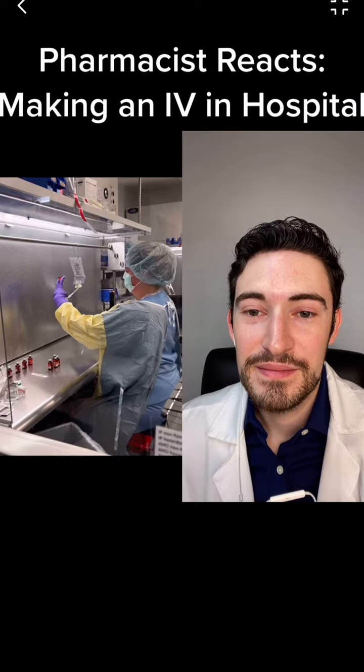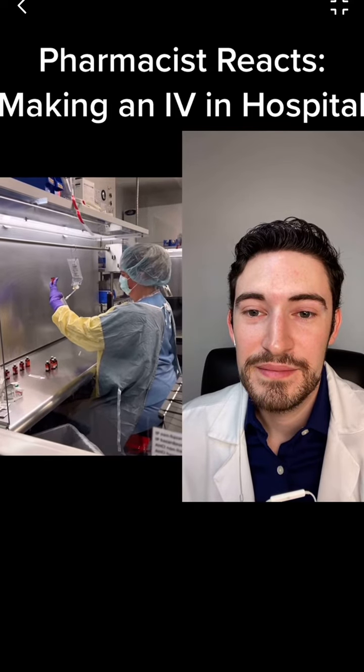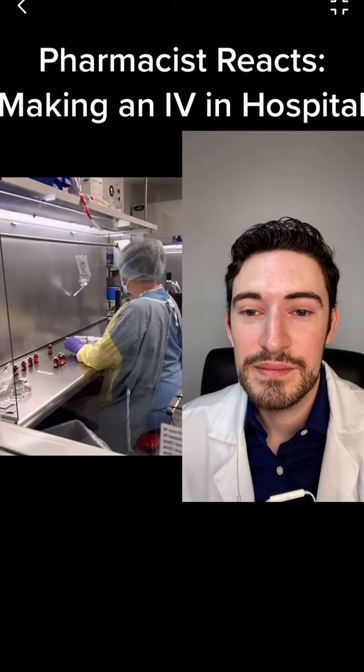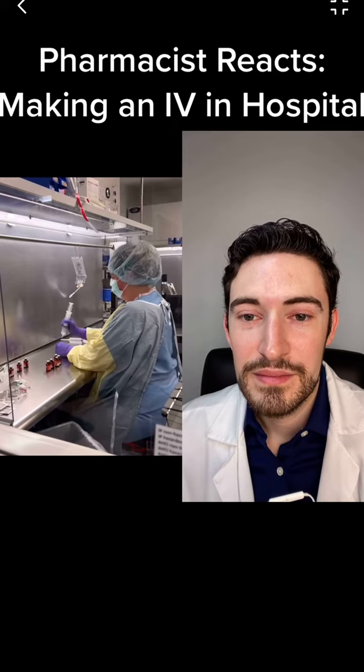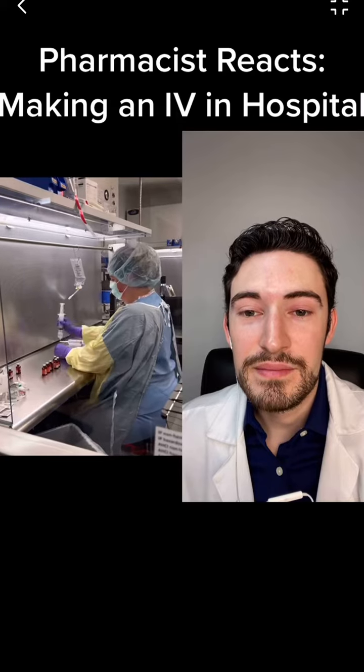As I mentioned, it's just straight drugs, so it's going to be 100 mils total, which is going to be 2 50 mil syringes. And then I'm just going to put that into the empty bag that I have hanging in the IV hood.